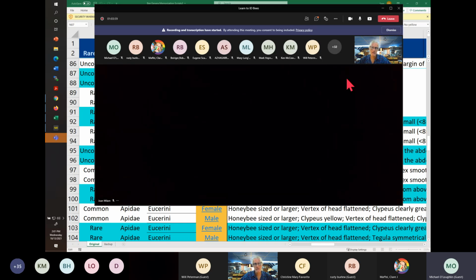I have to tell you that we don't use points because it slows us down. So we would have done the same thing, but glued it to the side of a pin. Additionally, I don't particularly like specimens most of the time on points. The point itself will often occlude some of the parts of the specimen, but then so again does the pin if it's glued to a pin.